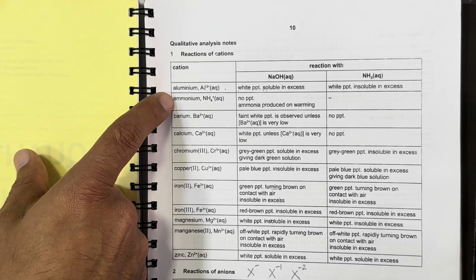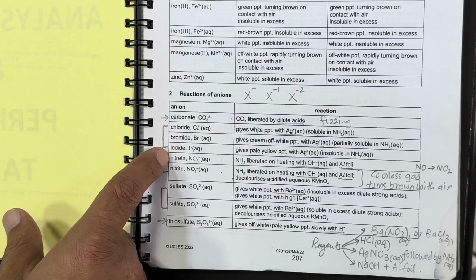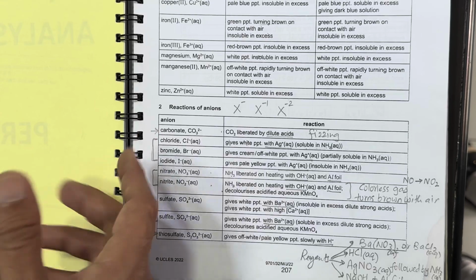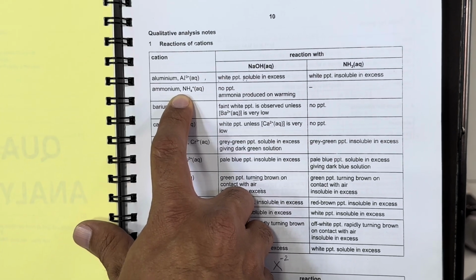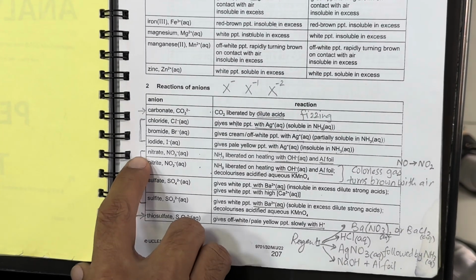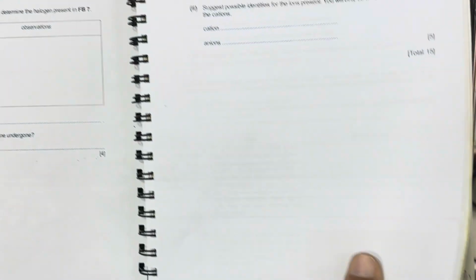So they are quite similar tests, as we need sodium hydroxide for both of these ions. Therefore, it is difficult if a salt contains both the ammonium ion and nitrate ions. It is difficult to detect these two ions simultaneously. But yes, we can detect in one way: if we add sodium hydroxide and we warm, first of all ammonia that is liberated will be because of the ammonium, and when the gas liberation finishes, then we will add aluminum foil and continue heating. Then again further ammonia will be liberated, that will turn the moist red litmus paper. So this is the difficulty here, so we will write this difficulty in this box.